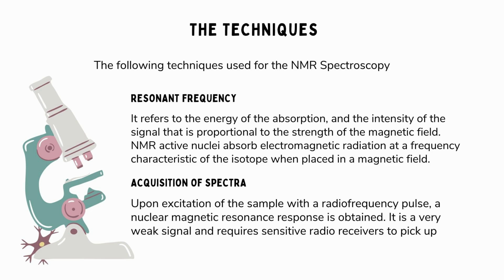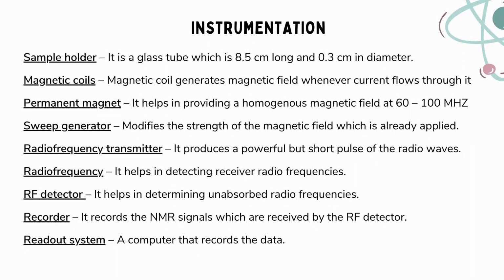2. Acquisition of spectra. When the sample is excited with a radiofrequency pulse, a nuclear magnetic resonance response is obtained. This response is very weak and requires sensitive radio receivers to pick it up.